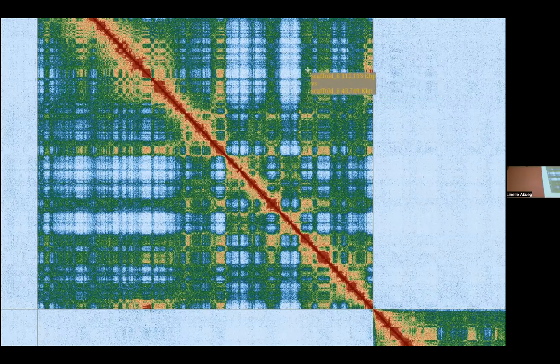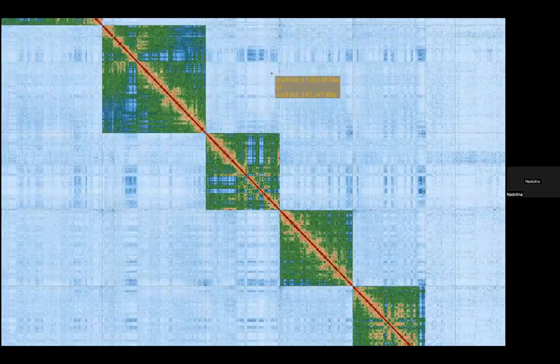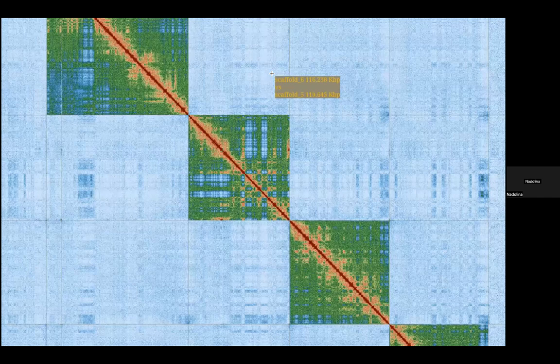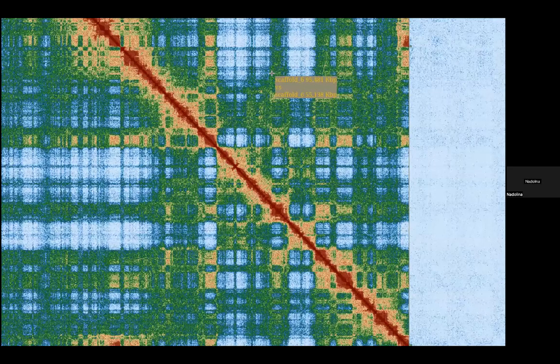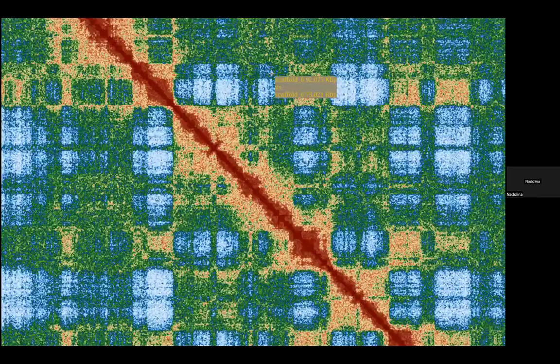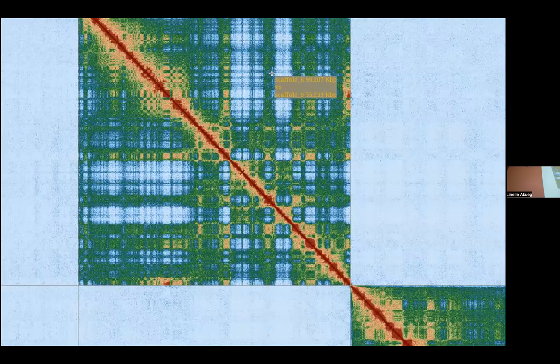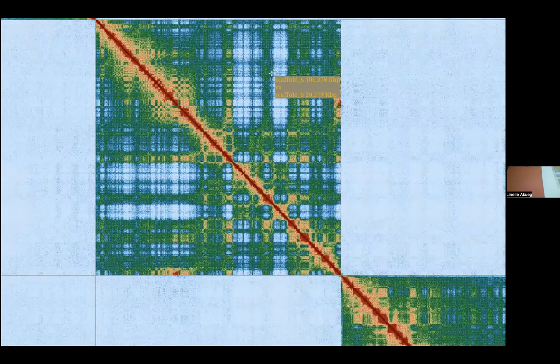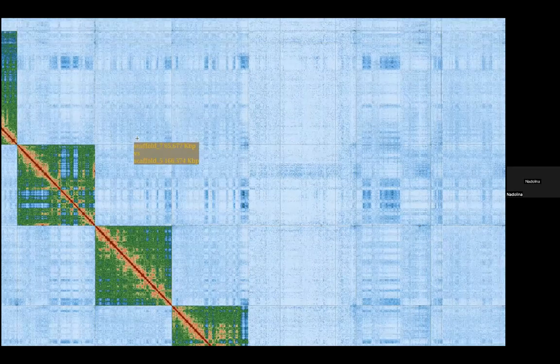Natalie, how do you zoom in and out again? So that is going to be just moving up and I have a Mac, so for me that's just moving with 2 fingers up and down on my scroll pad. If you have a mouse, it would be with your scroll wheel. How do you slide around? You have to hold down with 2 fingers and drag.